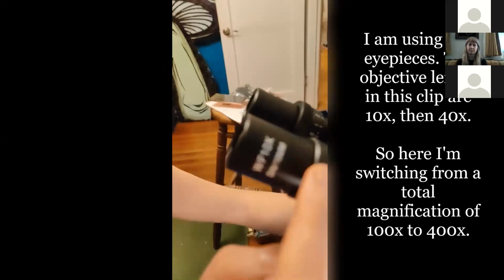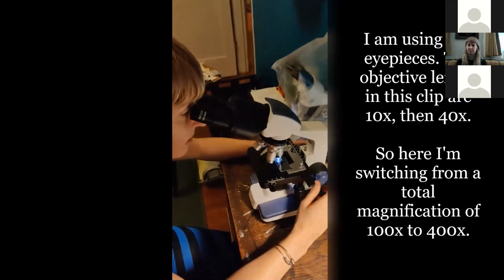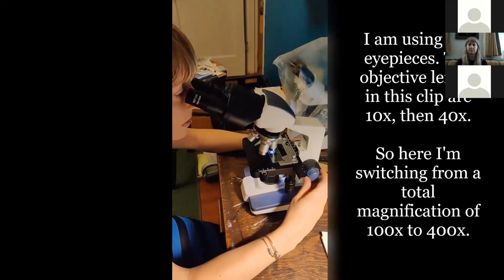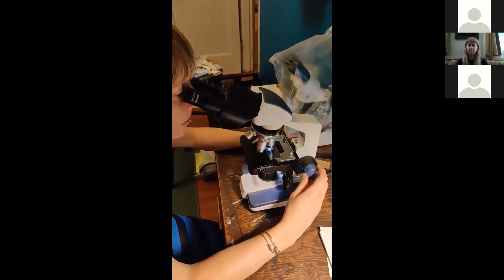So now I'm looking at 400 times magnification. All right, and I'm zooming in again with my fine adjustment. That's what I'm doing with my hand here. Okay, and now I've got spores.